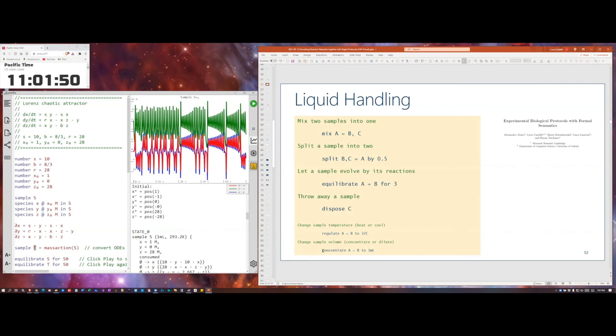Right. So is there the ability, like how you were showing, to program different distributions for random parameters? Could I have an understanding of which machines would be used in my lab, for instance? So if I know that the volume transfer falls within a certain bucket, a certain machine or transfer method would be used, and I know what the tolerances would be. And so I could inject that, but if it's a different volume, then I want a programmable if-then ability. Yeah, and then you would put that into your script, if you know what's happening. So for example, here I had this operation to concentrate this sample to a given volume, which would model evaporation or dilution, whatever you want to model.